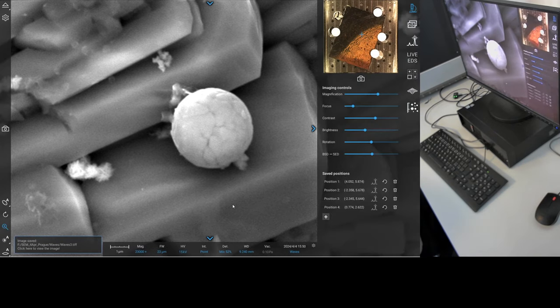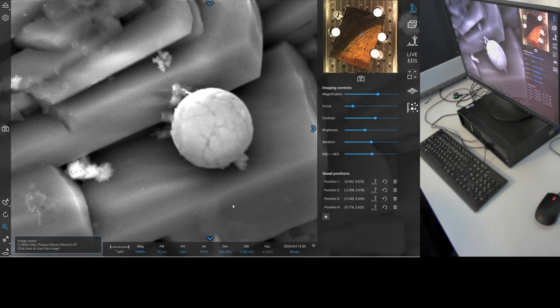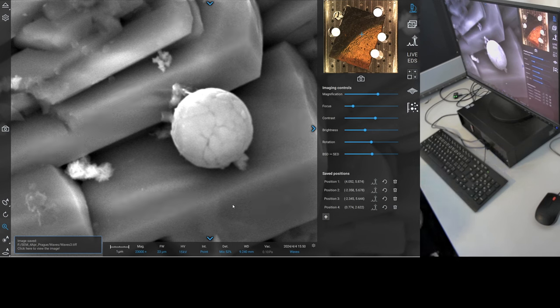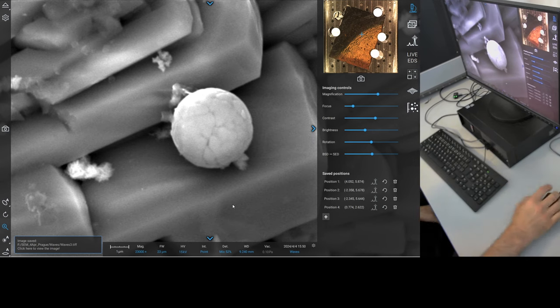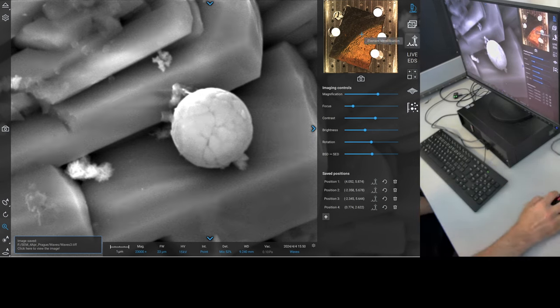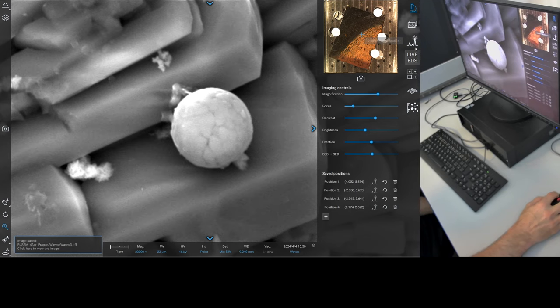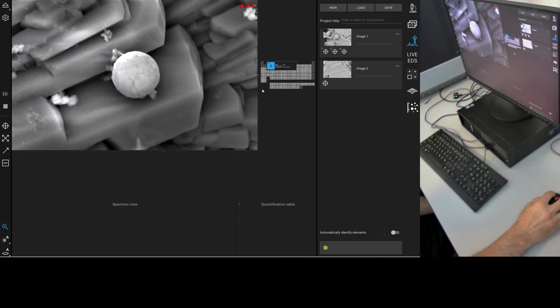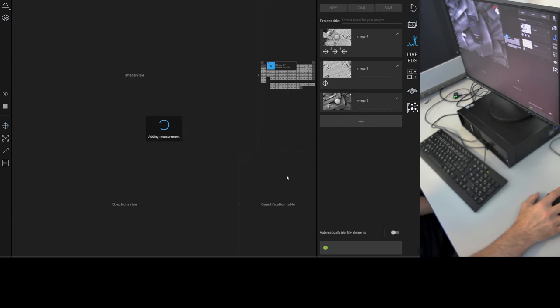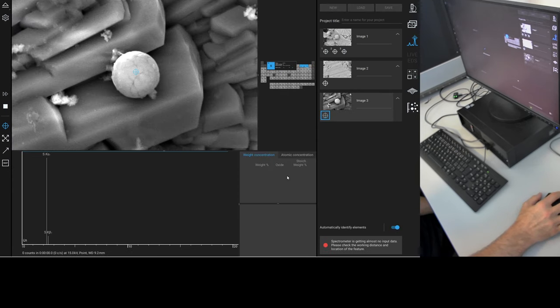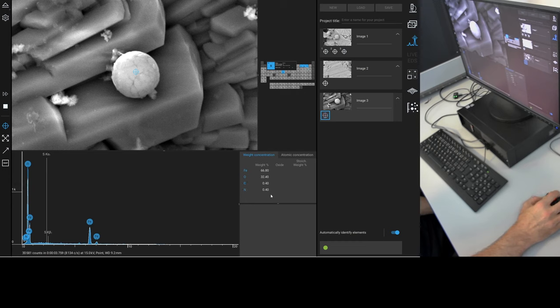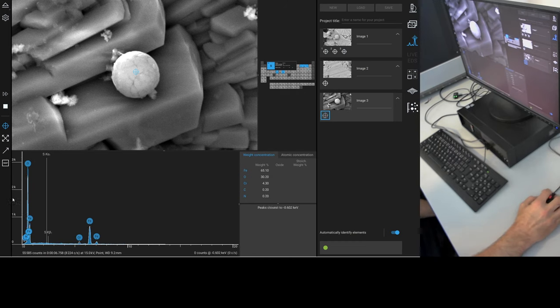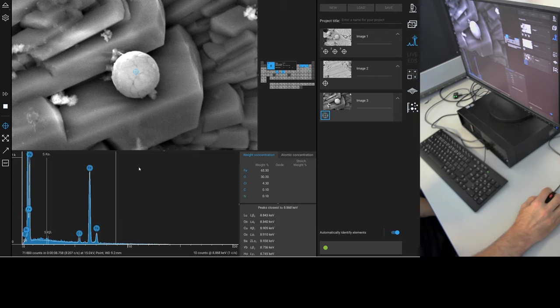Let's go and find an iron sphere. There's one. Let's just confirm that it is one of these iron-rich crenelated microspheres. And there we go. What is it? It is iron and oxygen, almost entirely. There we go. Shocking.